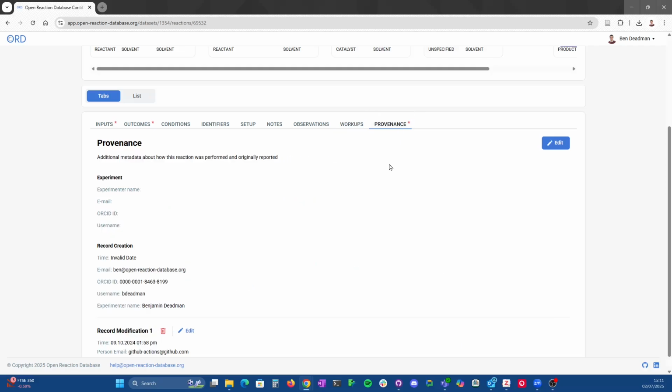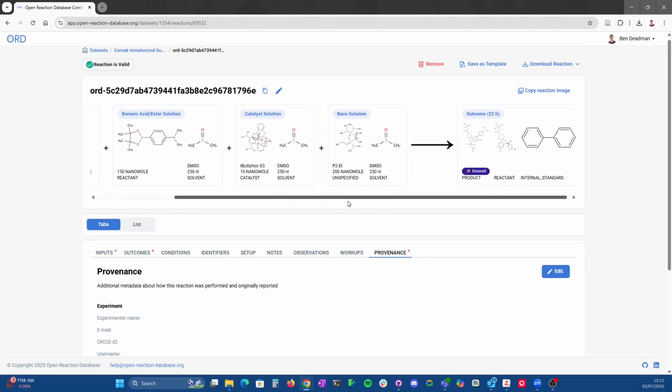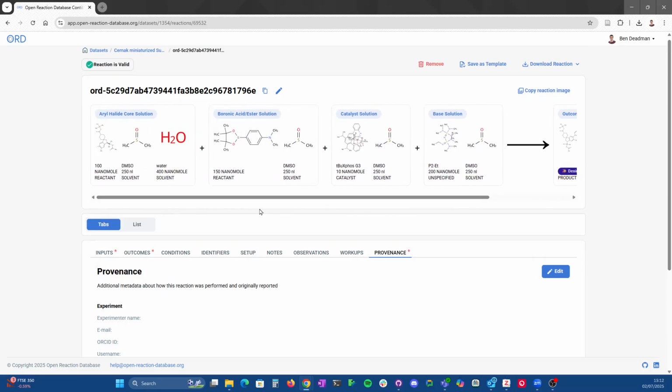The provenance then. So the provenance is our metadata about who did the reaction and who recorded it. So we have here, experiment details here. We don't actually, in this particular record, know who carried out the experiment, but then, it was my account that has created the record. And we see here a slight bug in the data that's been passed in. So that's a general overview of the Open Reaction Database Reaction Editor. In follow-up videos, we're going to dig into all of these fields in more detail to show you the workflows involved.